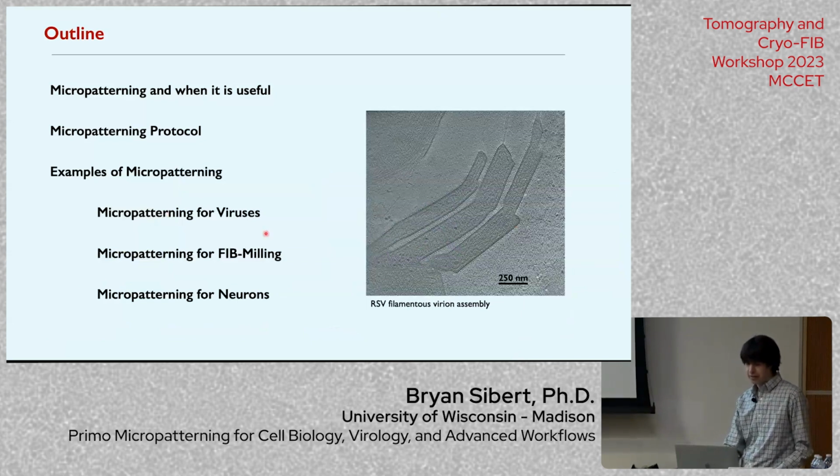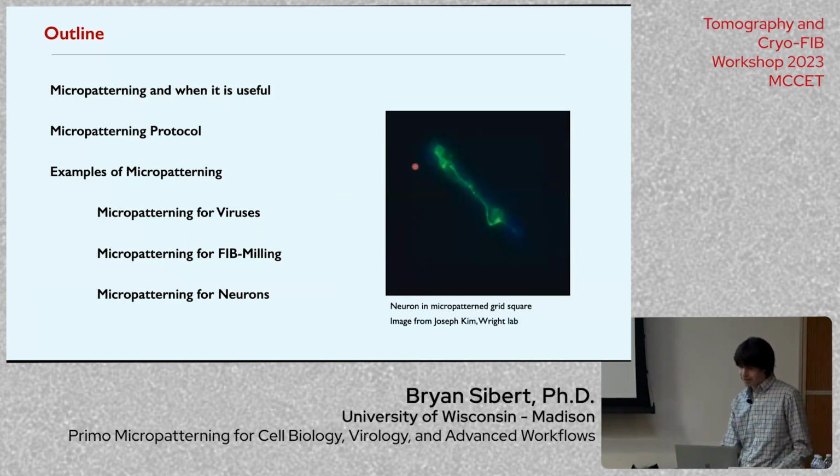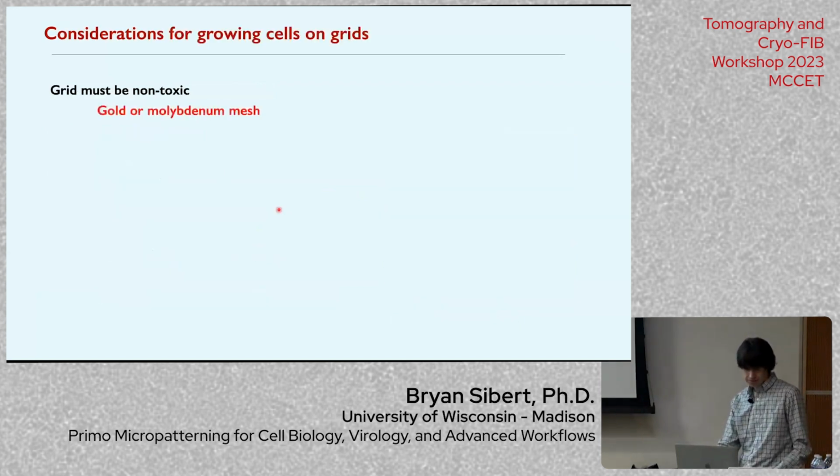Like I said, I'll just give a few examples of this. We've done micropatterning for projects related to viruses. Of course, it's very popular and useful for FIB milling. And Joe in the lab is also using it to direct neuronal cell growth on cryo-EM grids.